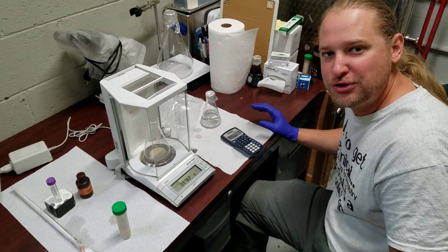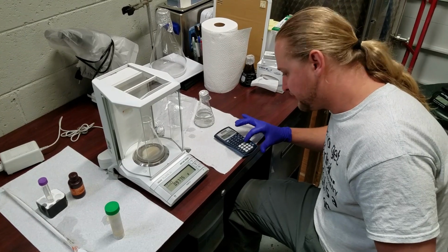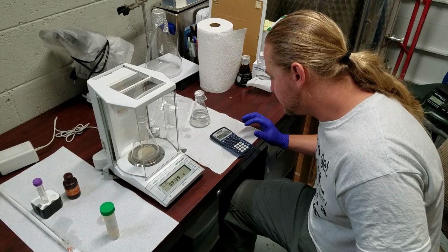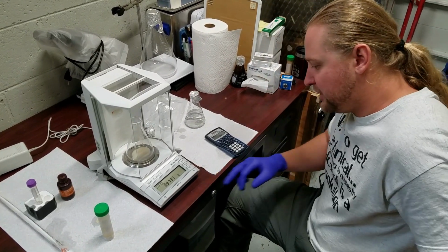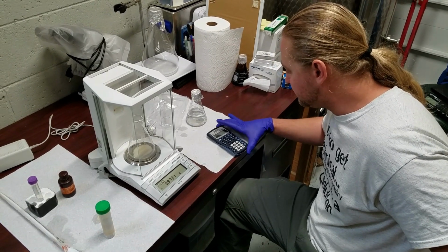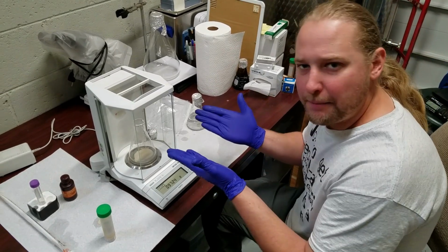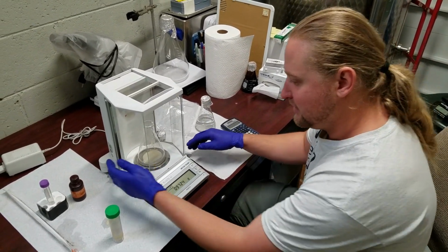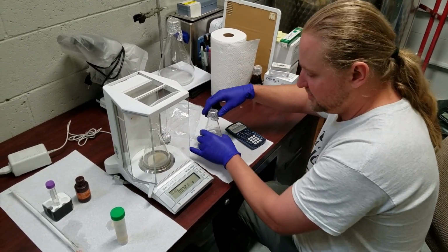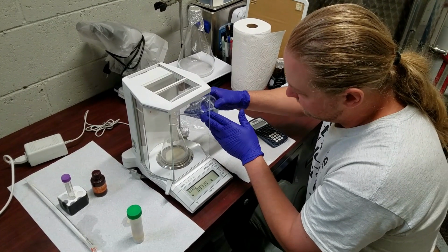So our first dilution is a 60-fold dilution. We'll use this calculator and go 0.97, it looks like it's pretty close right now. So we'll go 0.97 times 60. This leaves us at 58.2. So that's what we're going to top it off with water and get this flask to weigh 58.2 grams for our 60 dilution. So I'll just start off by pouring a little to get it close.